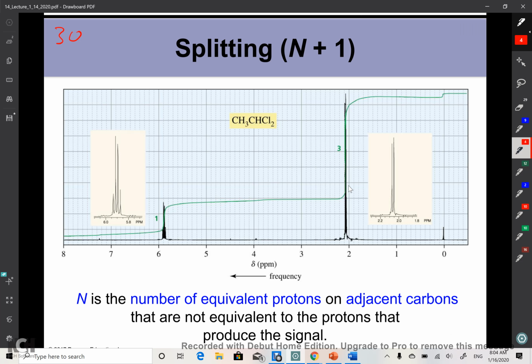Okay, so guys, let's continue from where we stopped last time. As a recall of what we did last time, we talked about two aspects of an NMR spectrum, how to interpret the spectrum. We talked about the position, the number of signals, which is an indication of the different types of atoms present in the spectrum.